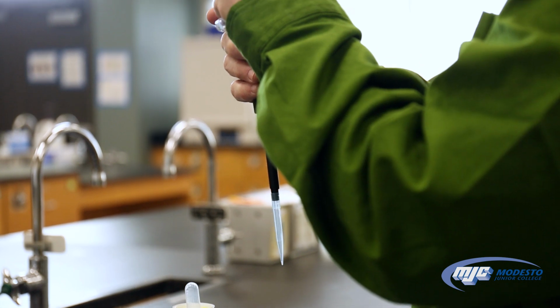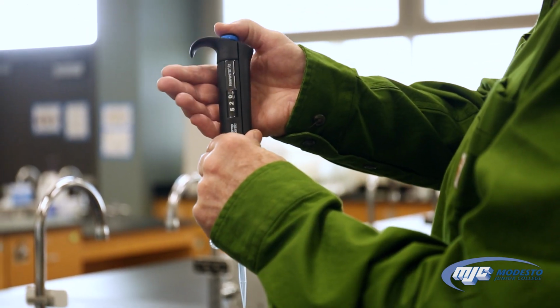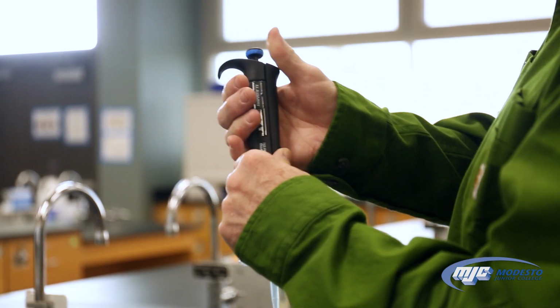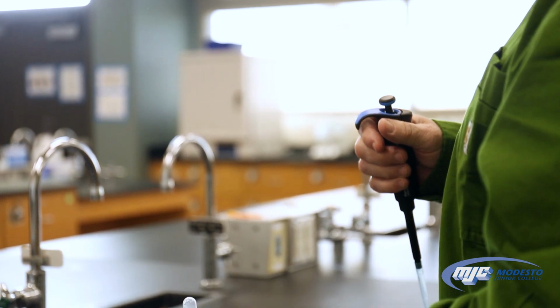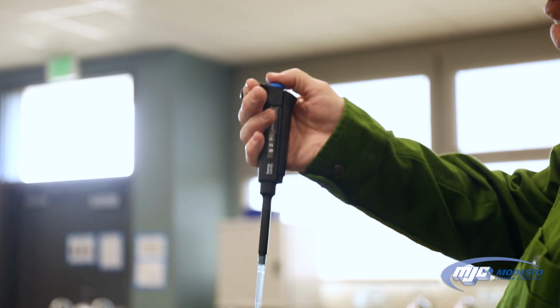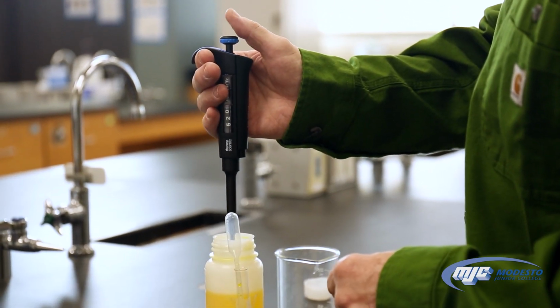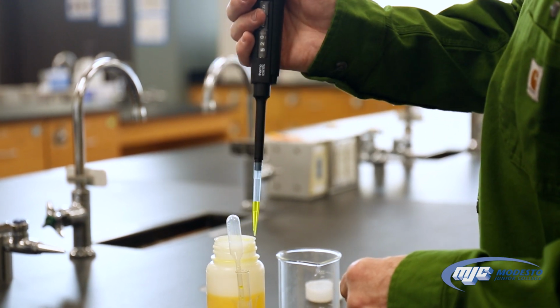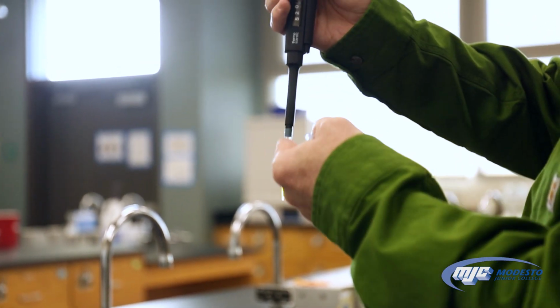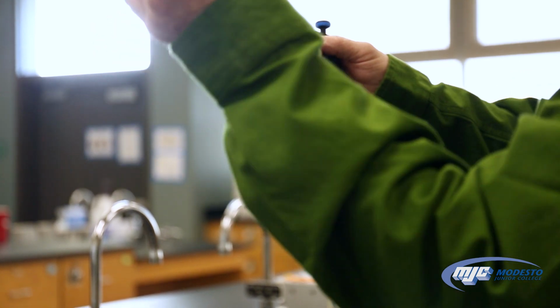Also, this button on top, this plunger, has 2 stops. One stop, and then if you press it a little bit harder, there's a second stop down there. When we're picking up the solution into the tip here, we depress the plunger to the first stop and the first stop only, put it into our solution, and then release it. Make sure there's no air bubbles, nothing on the sides, and there we go. Now we have 0.519 milliliters or 519 microliters in there, and let's say we're transferring it into here.